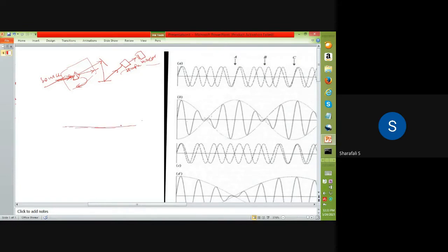So let's say this is your frequency. For example, you are starting from some 400 centimeter inverse, which means that associated with that, we'll be having one frequency. Then in the next rotation, we have a next frequency. In the next rotation, we have next frequency, like that. It is coming, and we have some, for example, 600 or 1000 centimeter inverse somewhere here.